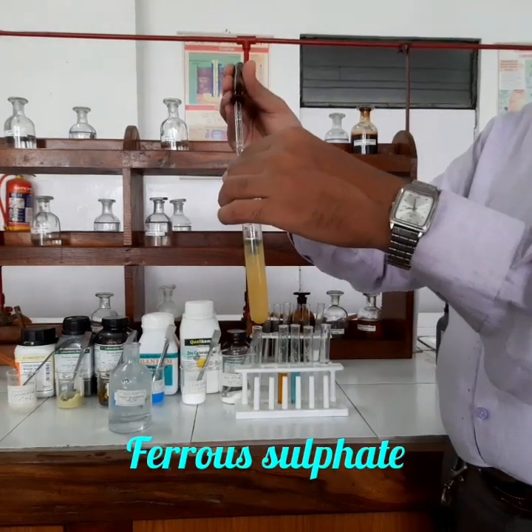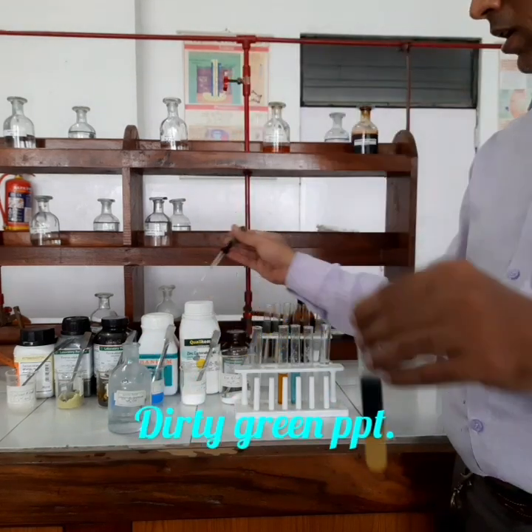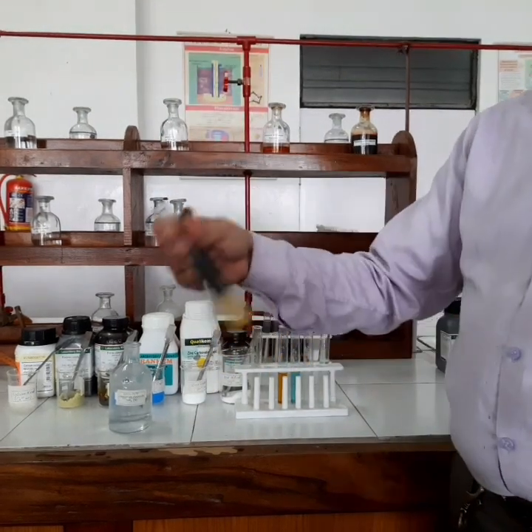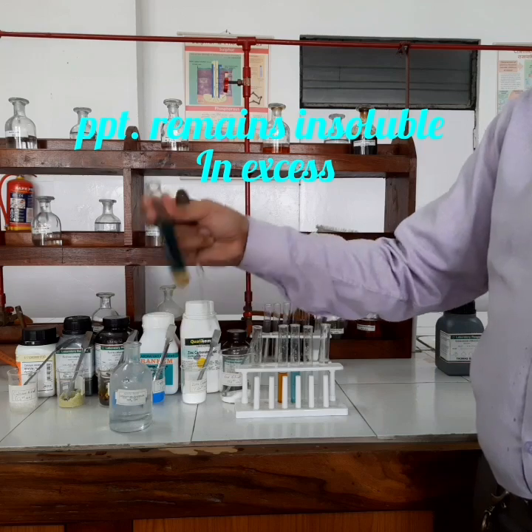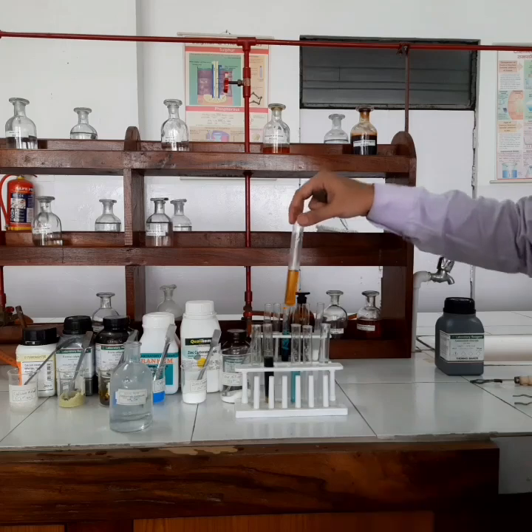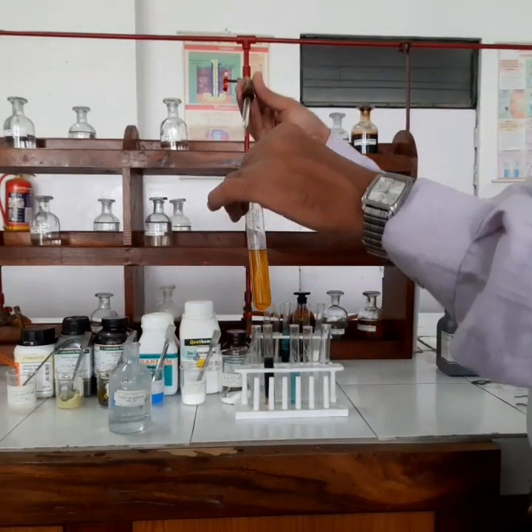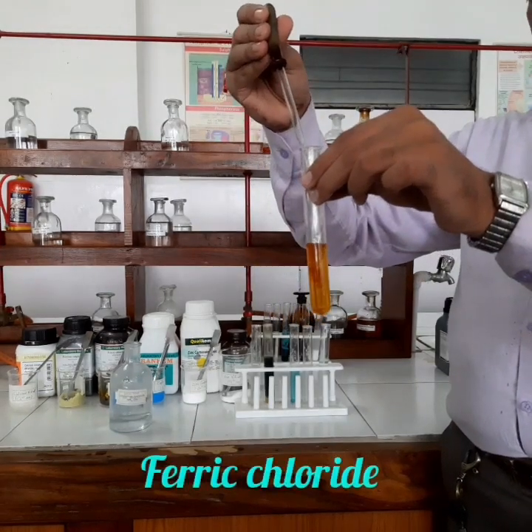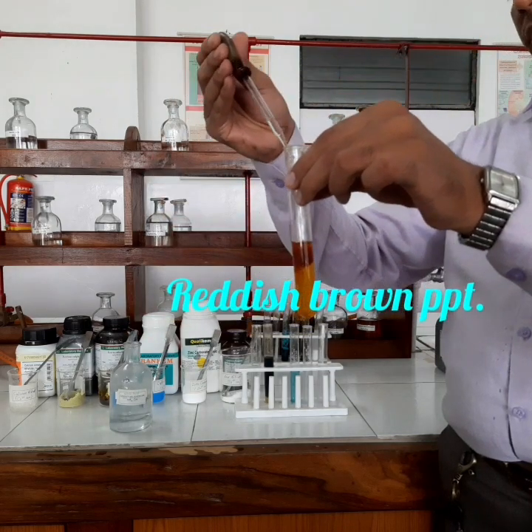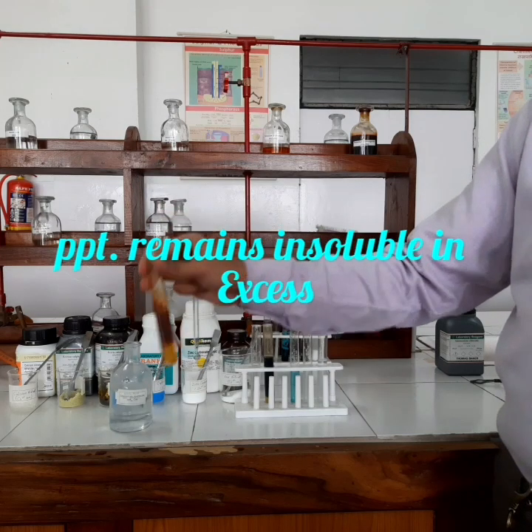For ferrous salt, as you can see, a dirty green precipitate is forming on adding ammonium hydroxide in limited quantity, and if I add it in excess also, this dirty green precipitate will remain insoluble. So this dirty green precipitate of ferrous hydroxide will remain insoluble in excess of ammonium hydroxide also. Then I am taking the salt of ferric ion. This salt of ferric ion on adding ammonium hydroxide will form a reddish brown precipitate. As you can see, the reddish brown precipitate of ferric hydroxide is getting formed, and it will remain insoluble in excess of ammonium hydroxide also.